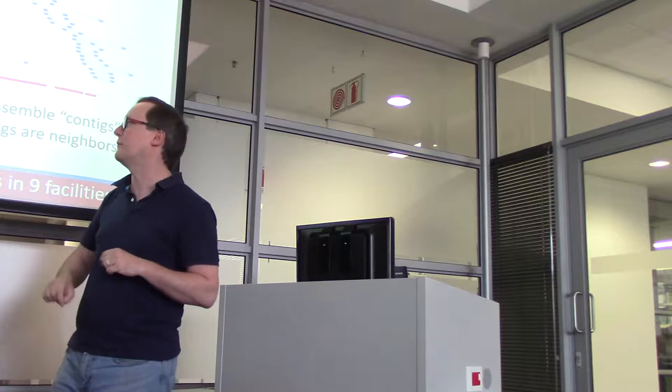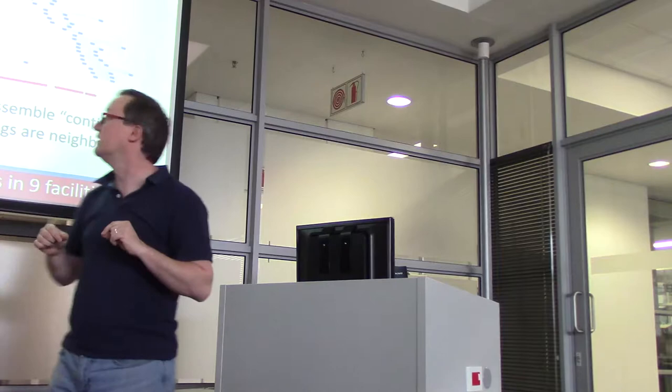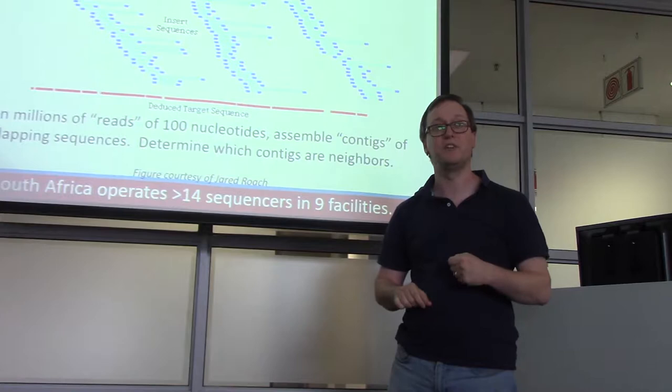So imagine each of these blue stretches represents one physical piece of DNA. And those dark blue patches represent the paired-end sequences. They're paired because you've got one on either end of this stretch of DNA. So if each of those little blue bars is a different stretch of DNA, oh, the slides will be available from my Google Drive. There's a link for it directly from the YouTube video, so you'll be able to get those as well. I was trying to mention that on camera too.